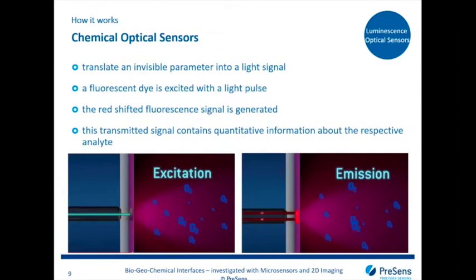Okay. Explaining a few more backgrounds about the actual measurement principle. As I just said, all our technology, so everything Presense offers, is solely based on light measurements. Everything is optical, so there's no current, electricity, voltage measurement involved of any kind.